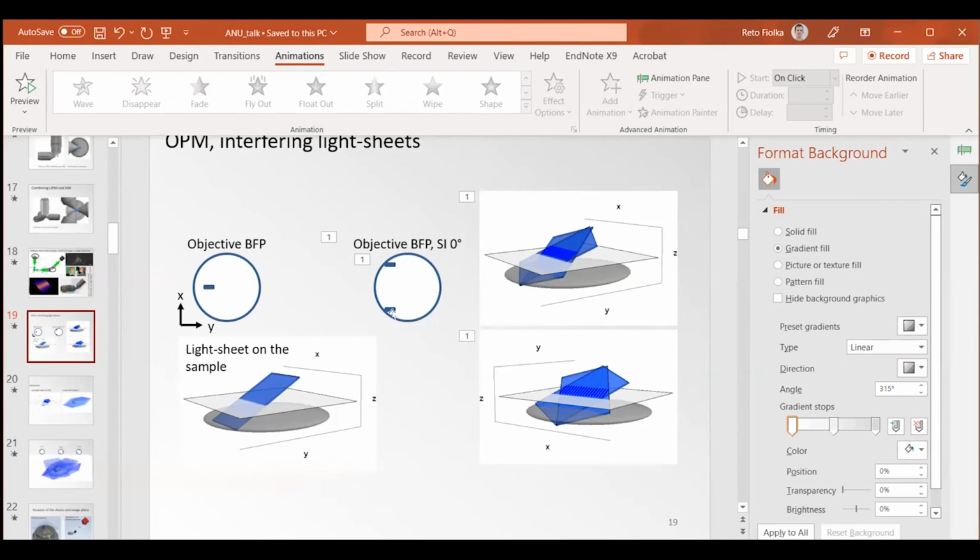The lattice would have its order centered, so you have to shift them to the side. In principle you can do that with some mirrors or others, because once they are at the edge or wherever you want them, and the image rotator is correctly oriented, then it will just rotate them.